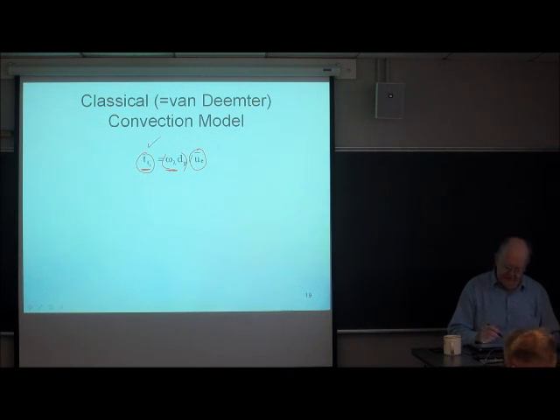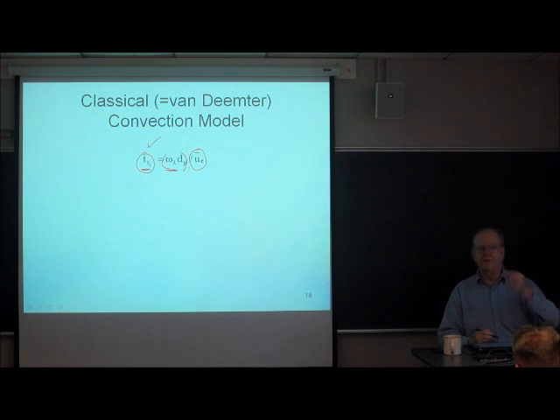Then we take this and we plug it into the equation that we derived by the random walk model for the HETP.